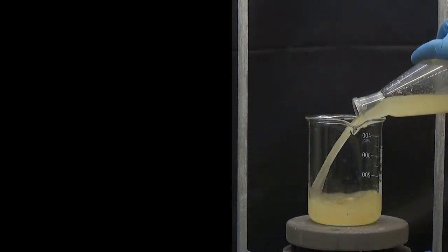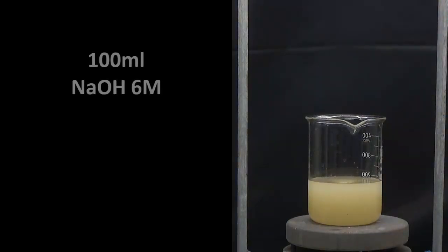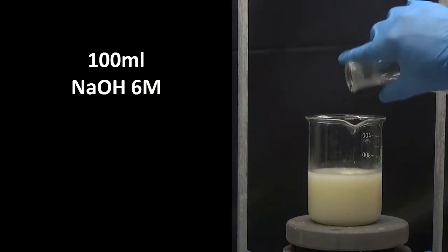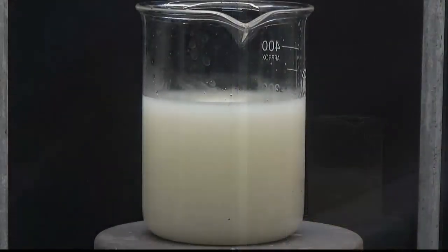Place the filtrate in a 400 milliliters beaker and add 100 milliliters of 6 molar sodium hydroxide solution. A white precipitate is formed that is possibly zinc hydroxide.